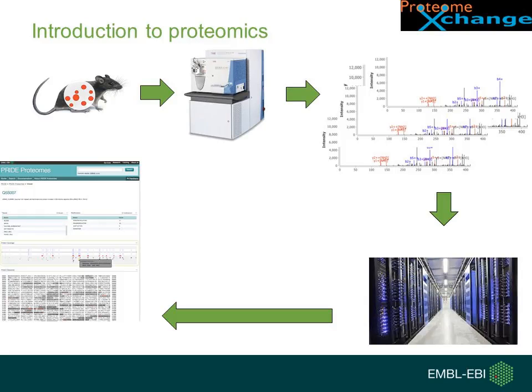So moving more towards the data representation aspect, what are the relevant parts of the data? We want to make accessible the metadata, and this comprises the sample description, the instrumentation, and the processing approaches which have been taken to convert raw data into the results.